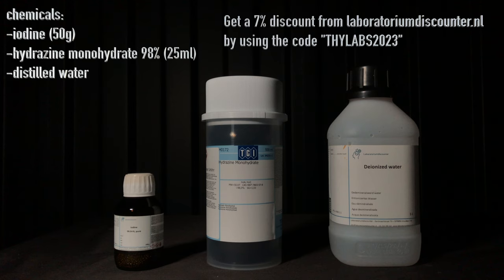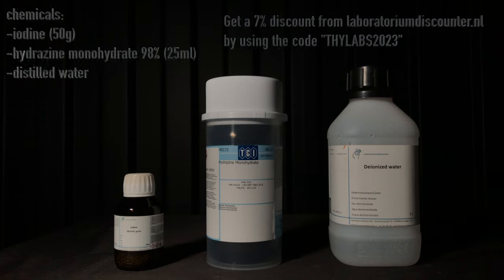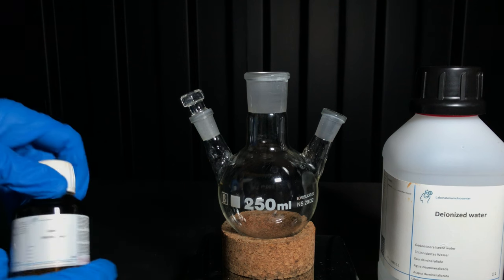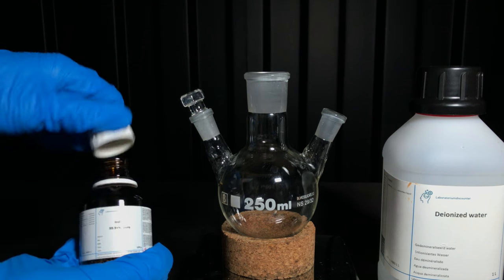For the preparation you will need 50g of iodine, 25ml of hydrazine monohydrate, and distilled water. We began by adding 50g of elemental iodine to a round bottom flask.